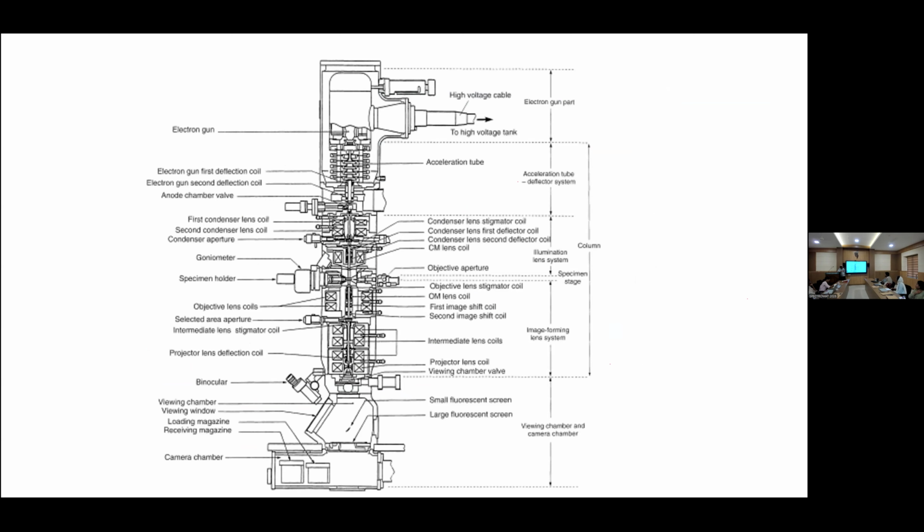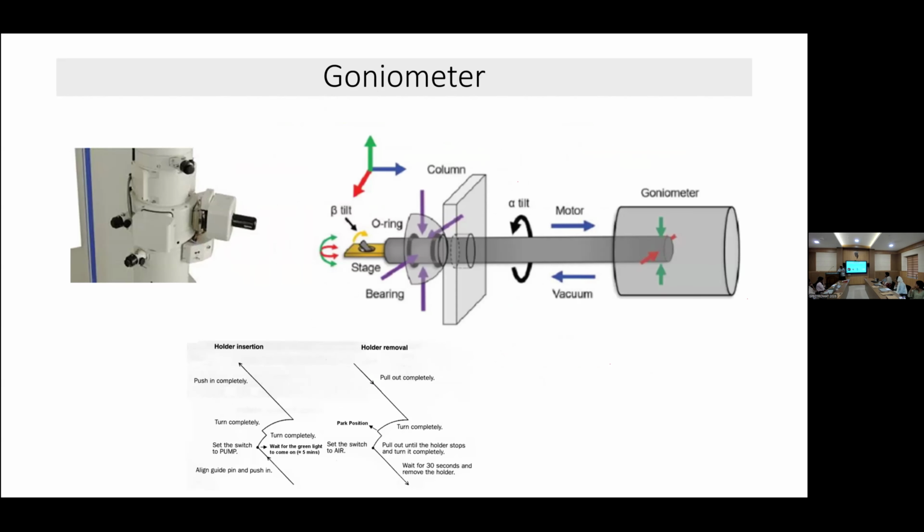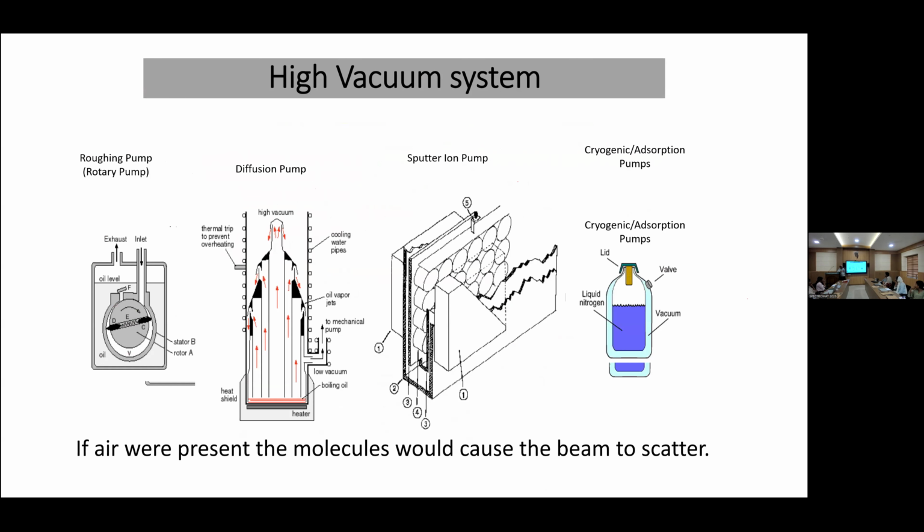Okay. And here we place this outside the cryo pump, and then copper wires go first to this sample region. So if some fumes come there, they will condense near the coil. And after use, we will just heat it up. We call it ACD, anti-contamination device, and there are ACD heaters. So we can heat the region and take it out. The condensed particles we can burn out. These are the pumping systems we are using in electron microscopes.